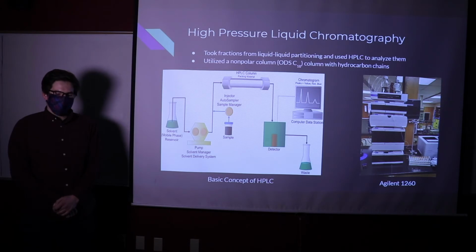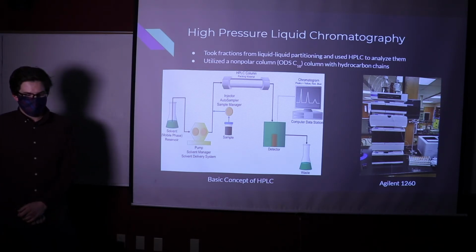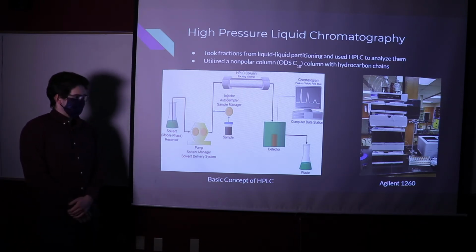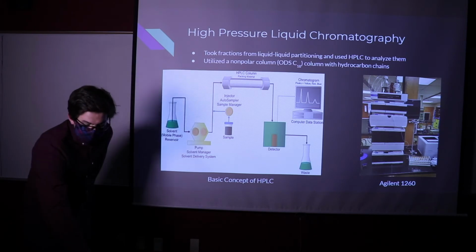And that detection will measure the absorbance of these compounds at different wavelengths of light. And in the spectra there, each peak corresponds to a compound in the sample.